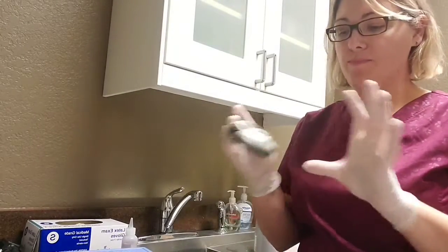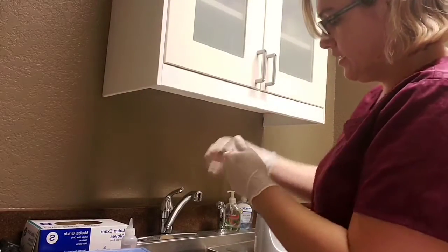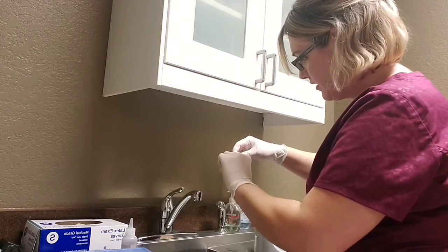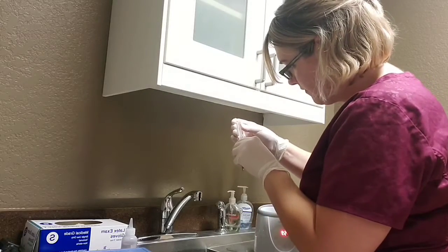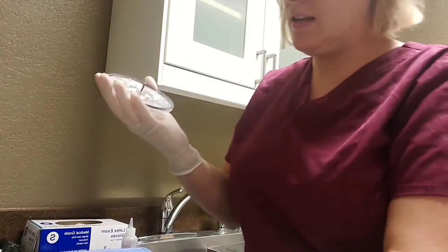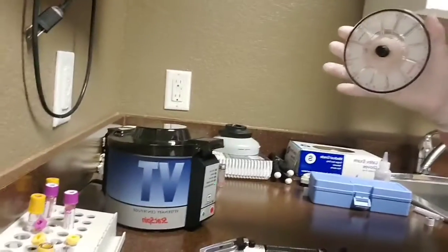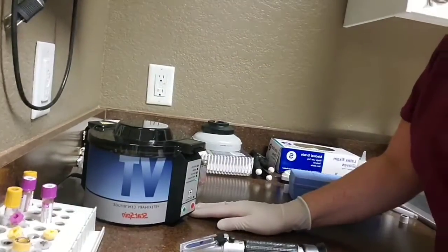All right, and there's our timer. We're just going to pull our tube out here, and I'm going to dump out my water. I don't really need that anymore, and hopefully be able to get my tube here. All right, there we go. I've taken my tube out of the incubation, and I'm going to place it back into my stat spin. I should be able to spin this without a balance, I'm hoping. I've done it before, and it seems to do okay. So we'll put it back over here in our stat spin and press start. Once that has finished spinning, we will come back and do the rest of our test.